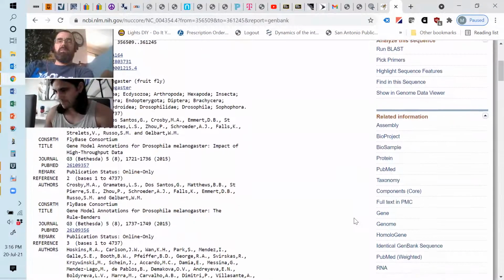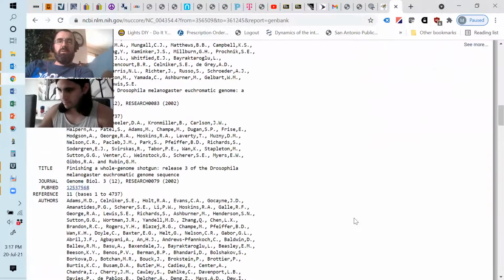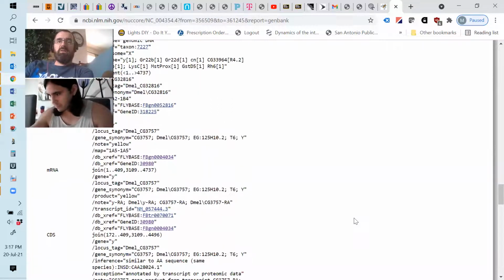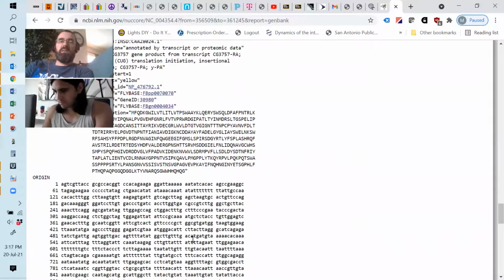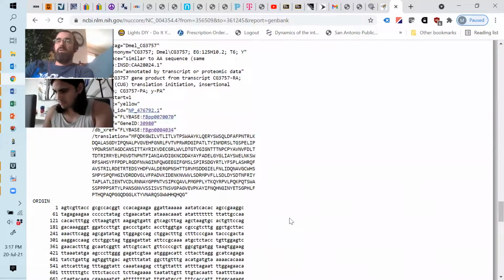And so now it gives you a whole bunch of information. Actually, it gives you the mRNA and the exon numbers here too, if you're willing to dig into it. So that's another way that you can get at that 5' UTR, exon 1, intron, exon 2 and 3' UTR stuff. But we're not going to worry about that. The actual sequence is here. This is what it looks like. 4,000 and a bit bases long.